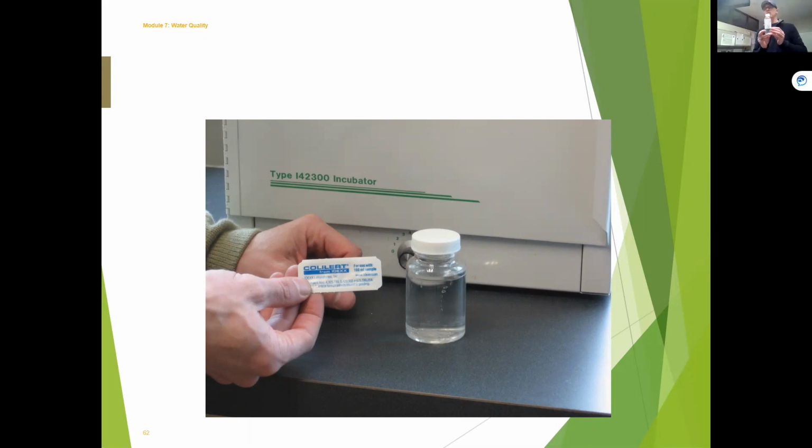Now, these bottles here, don't leave them on the dash. Don't put them in a cooler. Try to keep the temperature at about 4 degrees, like a fridge temperature, right? Don't freeze them. And that's one big problem for us. We actually almost have to keep them heated in a car so that they don't freeze. And then also be very careful with shipping.